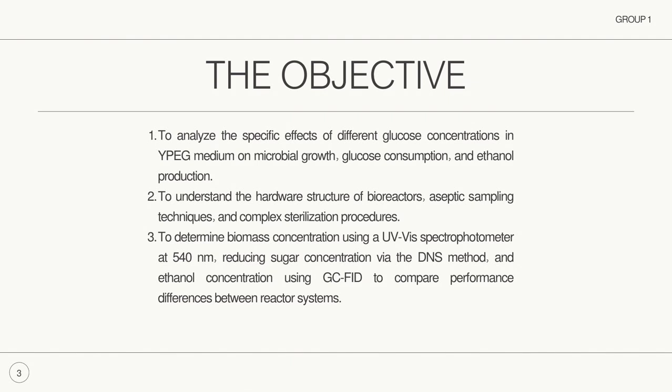Moving on to our core objective, our study focused on three main goals. First, we want to analyze the specific effect of varying glucose concentration within the YPEG medium. We are closely monitoring how these changes impact microbial growth, glucose consumption, and ethanol production.